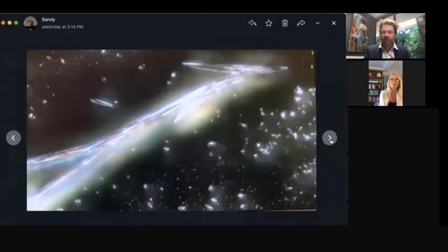So now we get to have some of the fun analysis with imagery. So you took some of the Clean Slate, put it on a slide, and then looked at that under the microscope, and then waited a few hours and looked at their behavior. So we're going to walk through some of these. This is one of the first images of the Clean Slate crystals and fragments under dark field microscope.